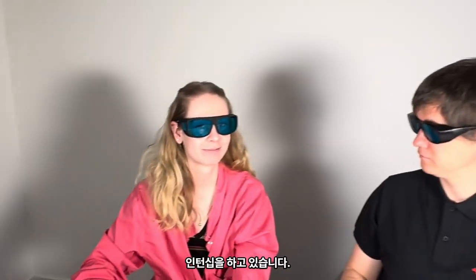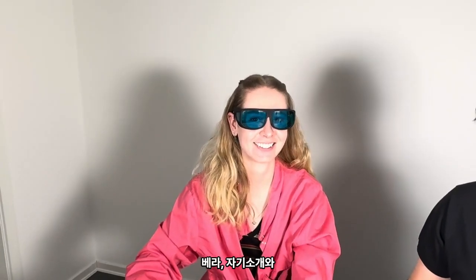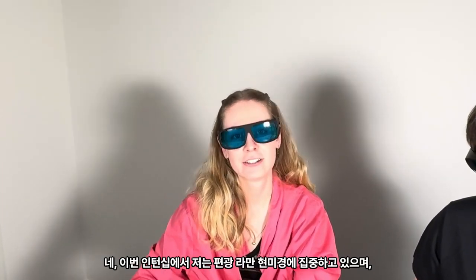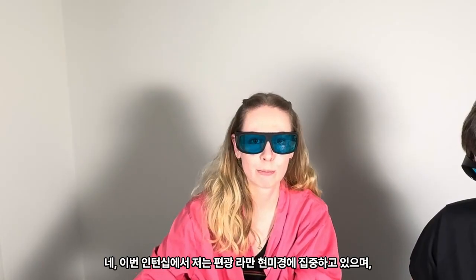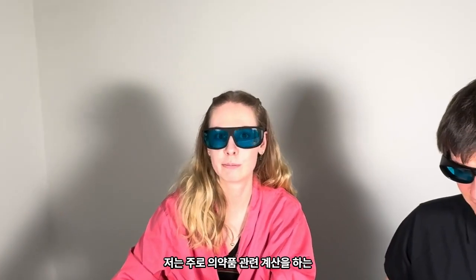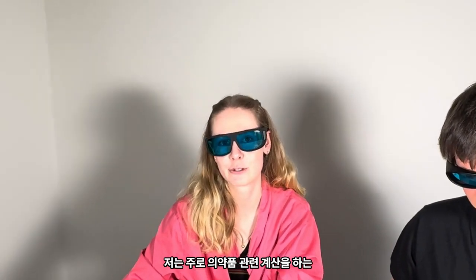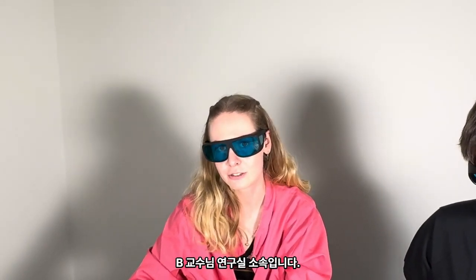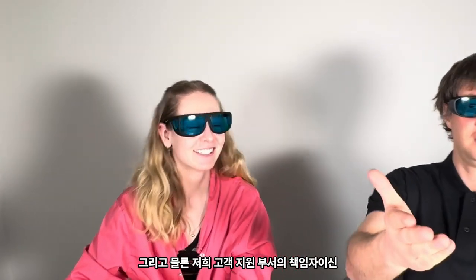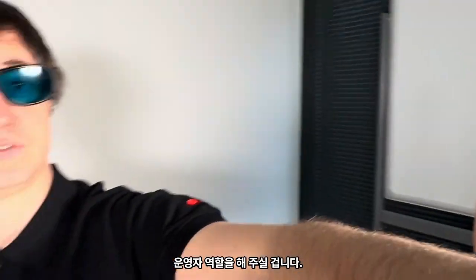And we are with Alexei, our CEO, and Vera, who is doing an internship with us. Vera, could you please introduce yourself and tell us about your internship? So in this internship, I am focusing on polarized Raman microscopy, which is what I also do in my lab in Prague. I'm from Professor Bour's group, where I do calculations, mostly on pharmaceuticals. Yes. Thank you. And of course, we have Yaroslav, as usual, our head of customer support, who serves as operator for us today.